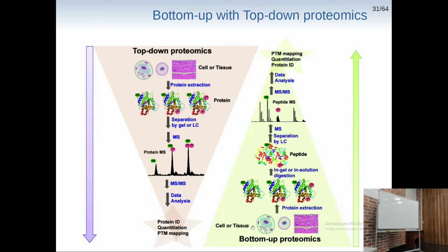We work with some set of them at the same time. But with this approach, we lose information on post-translational modification in some cases. Of course, in some cases we do get this post-translational modification, but we can't quantify it. And also, quantification here is hampered because we can get different peptides for the same protein for different samples, for instance, which is also a kind of problem.